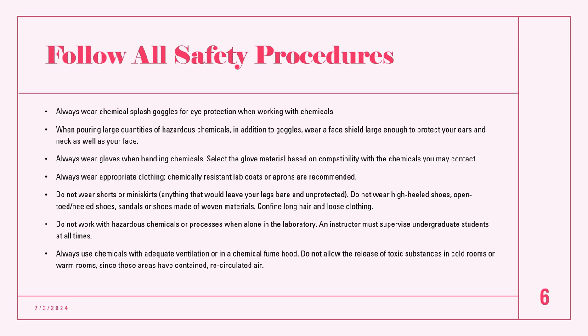Wear appropriate clothing like cotton material and chemical resistant lab coats or aprons. Do not wear shorts or miniskirts which will leave your legs bare and unprotected. And never wear high-heeled shoes, open-toed or heeled shoes, sandals or shoes made of woven materials. Confine your long hair and loose clothing. Do not work with hazardous chemicals or processes when you are alone in the laboratory.